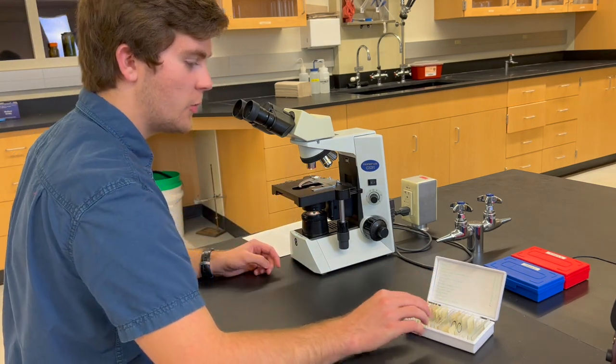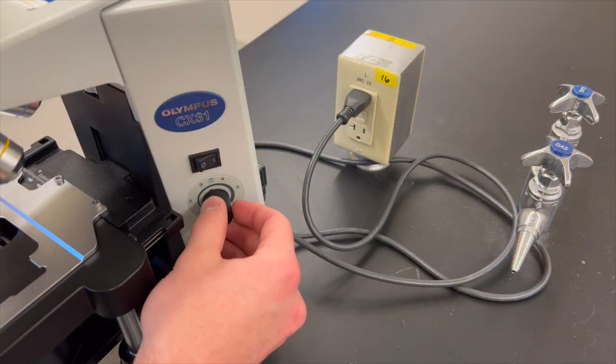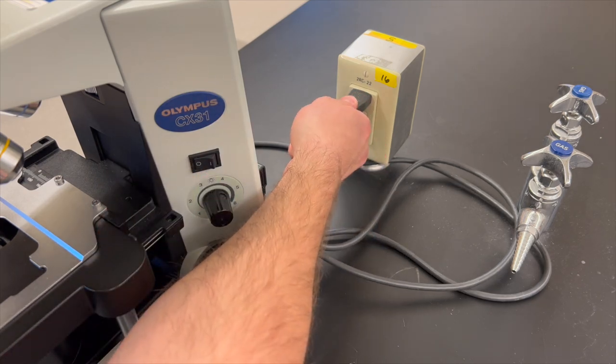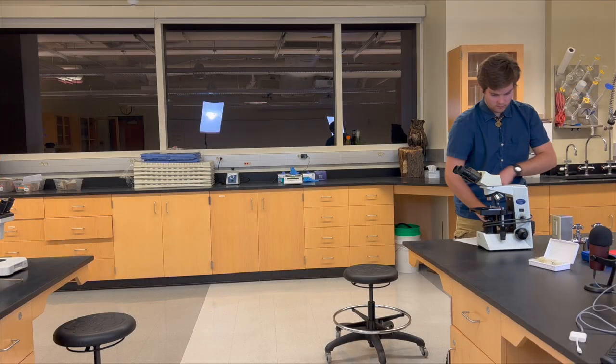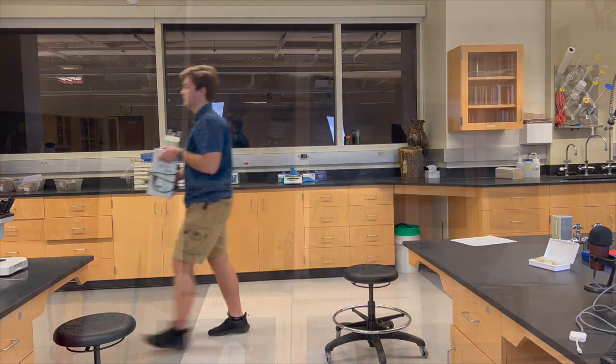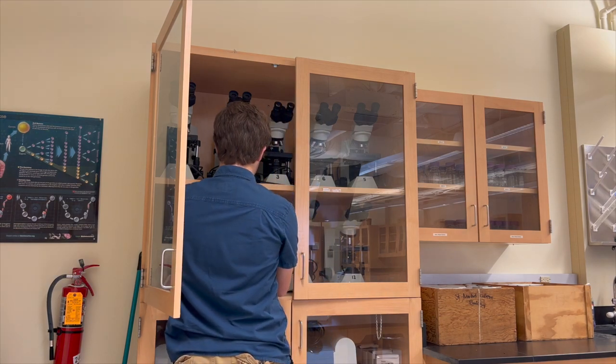Once that's done, put your slides and your microscope back where you got them from. Additionally, be sure to turn down the light intensity dial and switch off the power before unplugging the microscope. Properly carry the microscope using the front and back handles, and never slide or push a microscope across a bench, as that could misalign delicate lenses and mirrors.